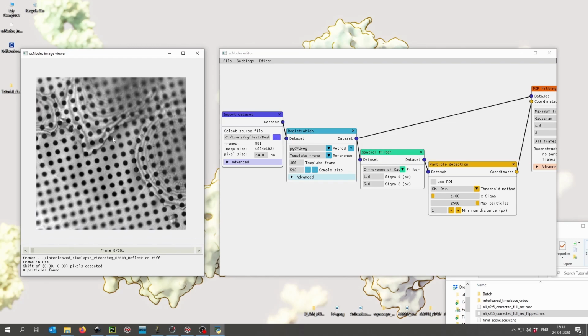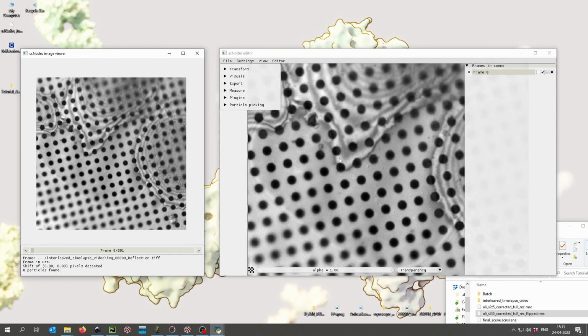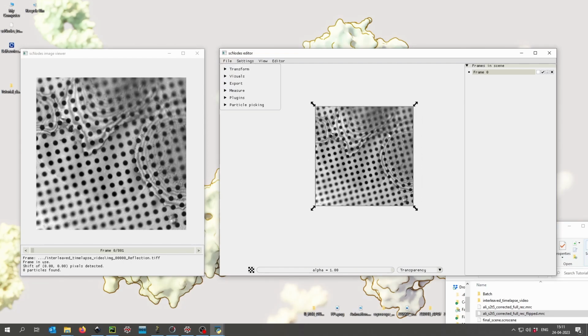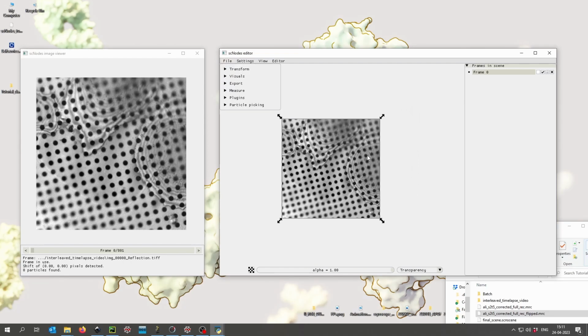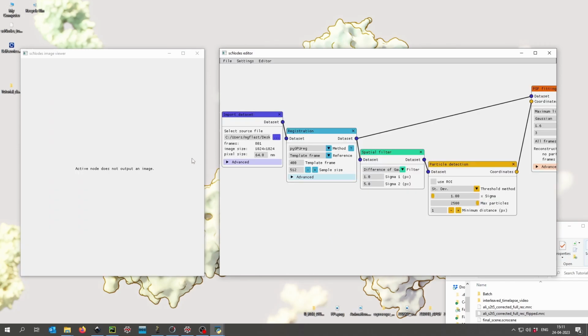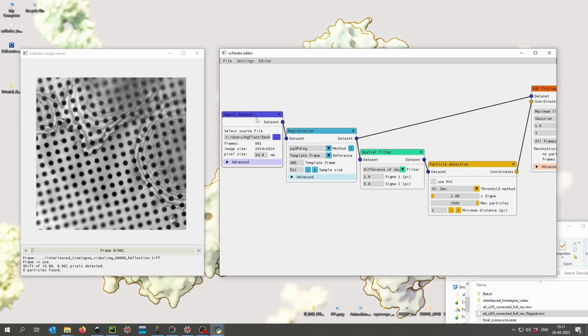You can do so by right-clicking and then pressing Add to Correlation Editor. And if you press Tab to switch into the different editor, you'll see that it shows up there. You can also go to File, Import Data, and then select any file that you would want to import. But now we've put this here so that when we get to the EM data correlation, we've already got the reflection image in the scene. Then back to the node editor.